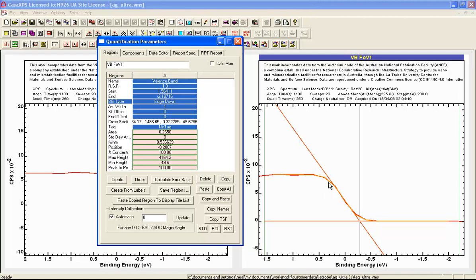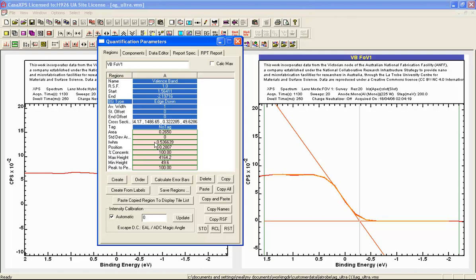Now the complementary error function is an integral of a Gaussian. So the width of the Gaussian that was used to calculate this error function provides an estimate for the interval over which a step occurs. So we then can report a full width at half maximum that is associated with this error function. This appears in the full width at half maximum field in the region.